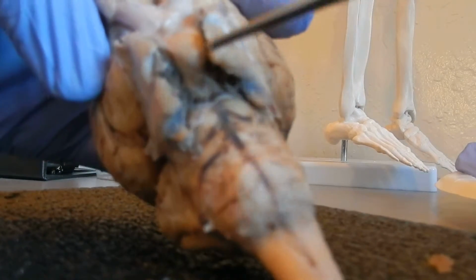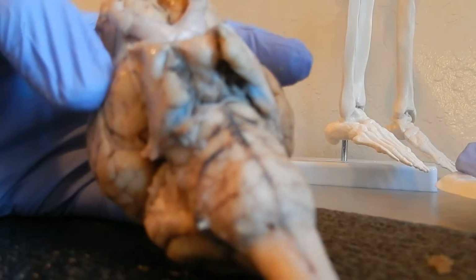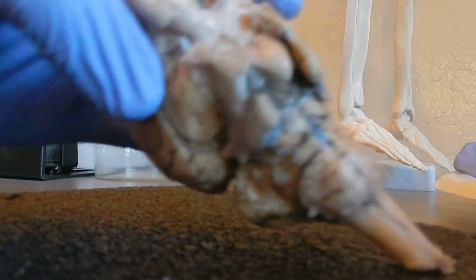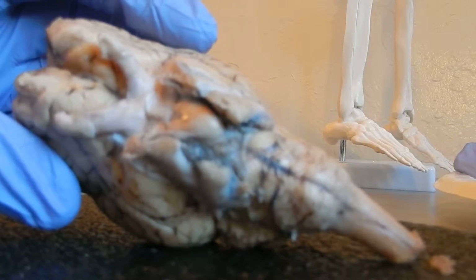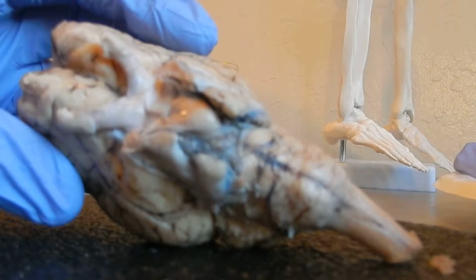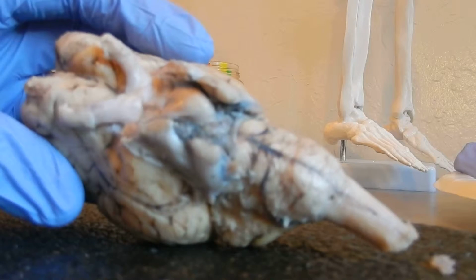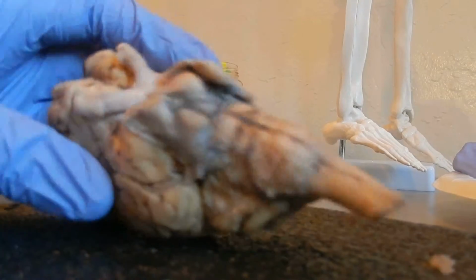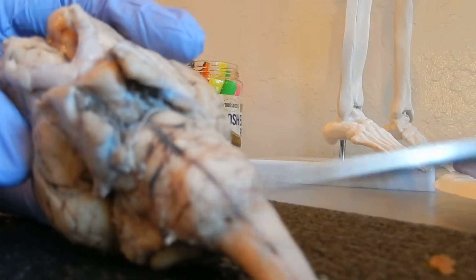We have the cerebellum here in the back. On the inferior side of the sheep's brain. Then we're going to go a little bit deeper here. Medulla oblongata here, spinal cord here.